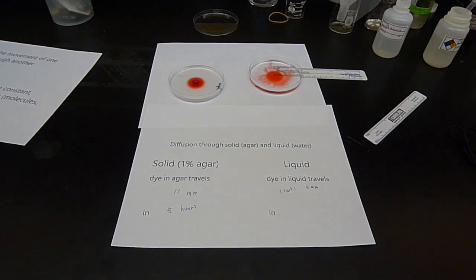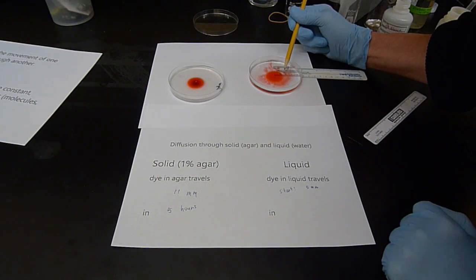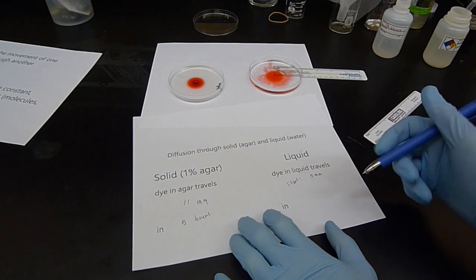So we're back, it's just about 3 minutes. I'm going to look here, and I'm going to measure, it's kind of scattered, but I'm going to say this is at 16 millimeters. Start out at about 5. It's really moved quite a bit, so I'm going to say 16 millimeters.